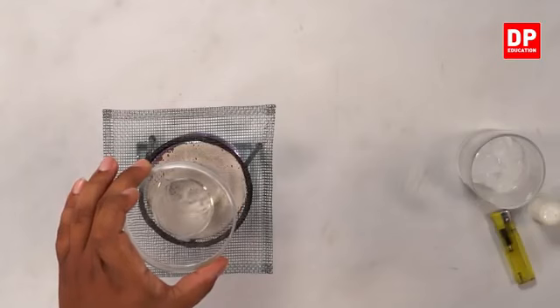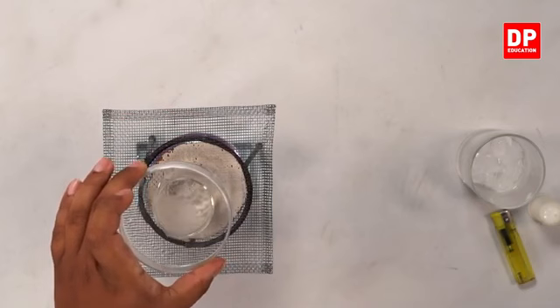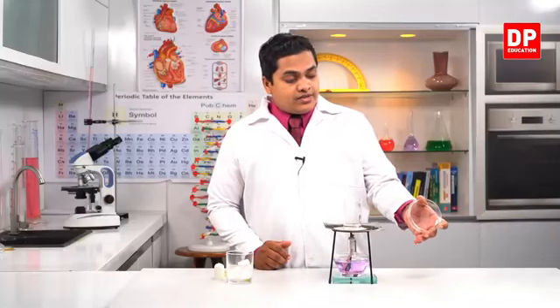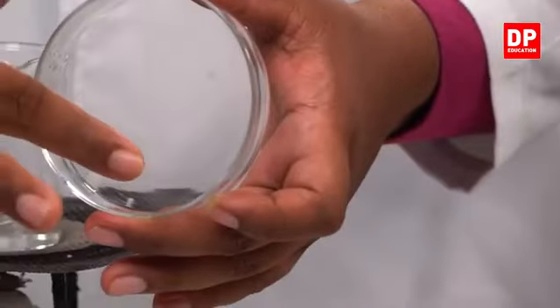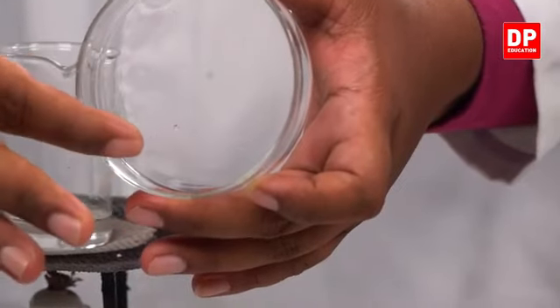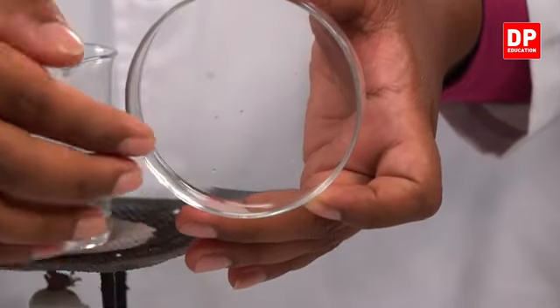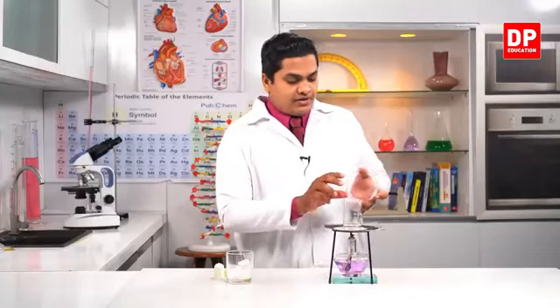These are water vapor, and when it hits the petri dish, it's getting cooled down. See, you can observe it very well. See, there are droplets of water in here, right? So I'll keep it once again.